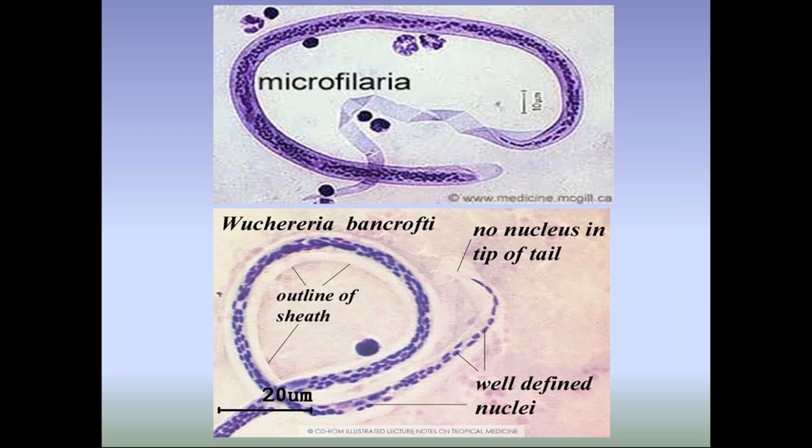Sometimes, with diurnal periodicity, the larval worms come during the daytime, not at night. That is the African worm, Loa loa. And subperiodic means present throughout, with a slight increase in the afternoon. Non-periodic means there is no particular time for observation of the microfilarial larval forms, as in Onchocerca and Mansonella. Particularly for Wuchereria bancrofti and Brugia malayi, there is nocturnal periodicity, 9 p.m. to 2 a.m.